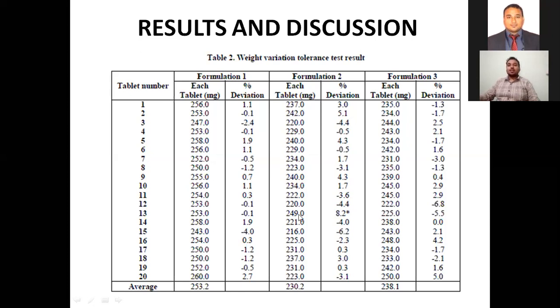According to that, the weight variation deviations you can see by calculating the weight of each tablet. The average tablet weight is given here, that is 253, by calculating all each weight of the tablet of the 20 tablets.